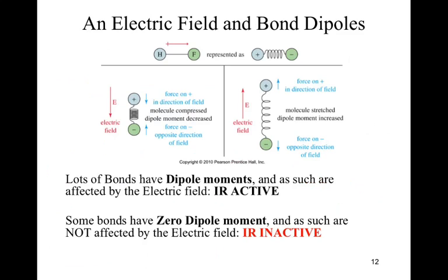Subtle point to discuss. It shows up very, very rarely, but it is kind of important to mention. IR is really looking at kind of an electric field. So what we want to see is a dipole. So all of the signals that we detect are ultimately due to a dipole. And pretty much all bonds have dipoles, pretty much. Even when we look at a carbon and hydrogen, I know we said that that was a covalent bond, but the electronegativity is not exactly the same. Neither is the size. So we do end up seeing a slight dipole in this case, probably going this direction. So we see a slight dipole in that bond.